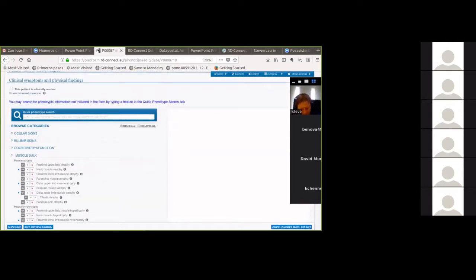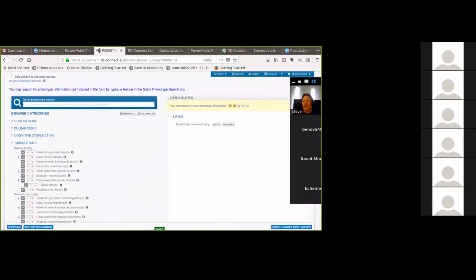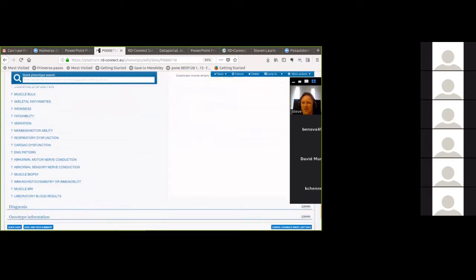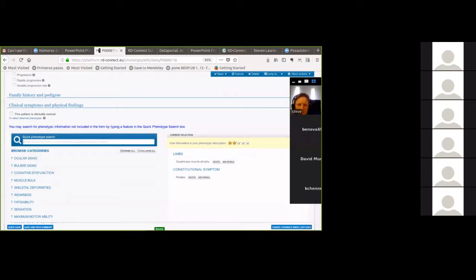If it's not there in the expected location, you can type in 'quadriceps muscle atrophy' in the search box and it will find it, highlighting it in the correct place in the hierarchy. You can see it's within 'limbs' in this case. We do the same for other phenotypic characteristics — for example, myalgia or muscle pain, which is a constitutional symptom. So what we're doing here is describing the case in some detail.